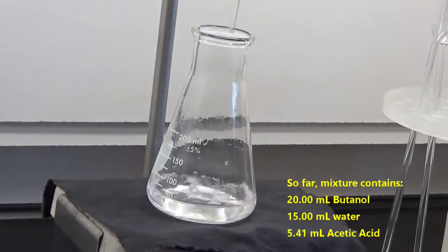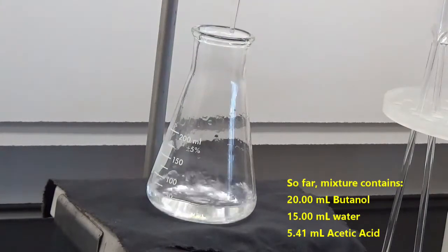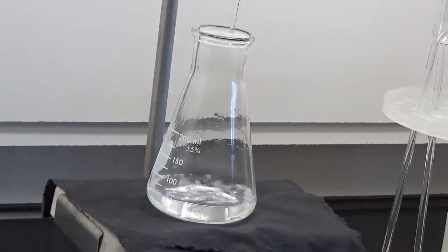And now I add another 5 mils. So let's see, this is, I added 5 initially, then I added 5 more, then I added 5 more, and then this is now the 4th addition, including the initial one.